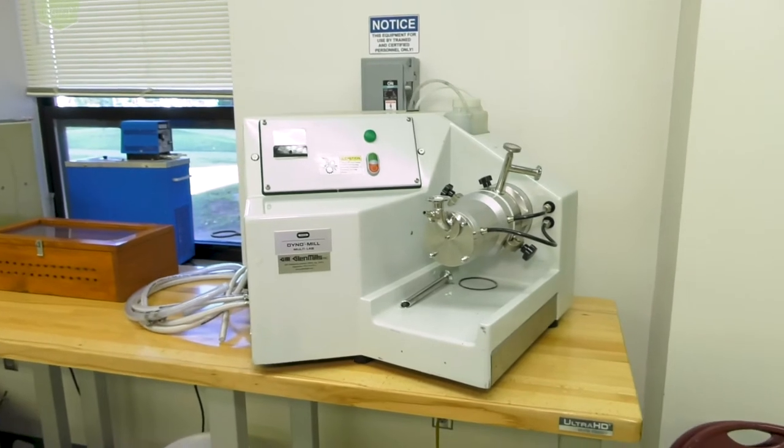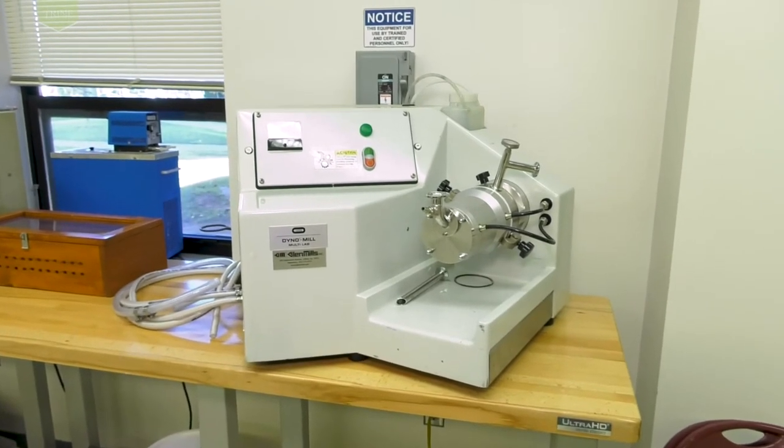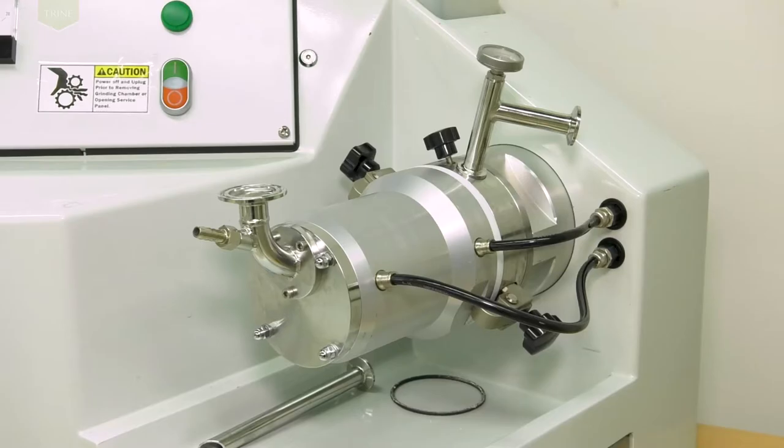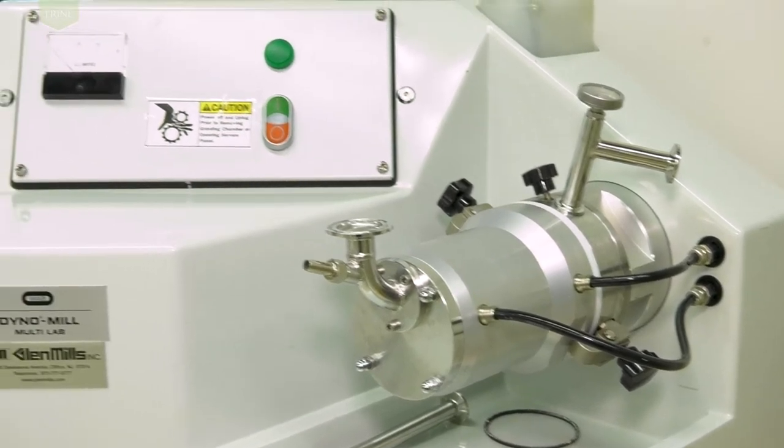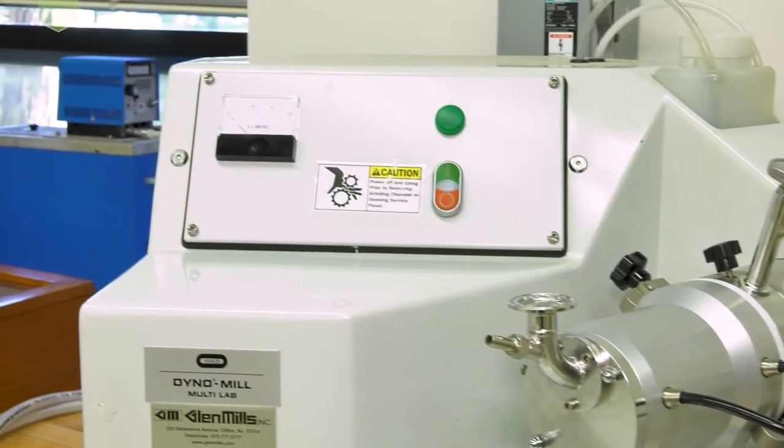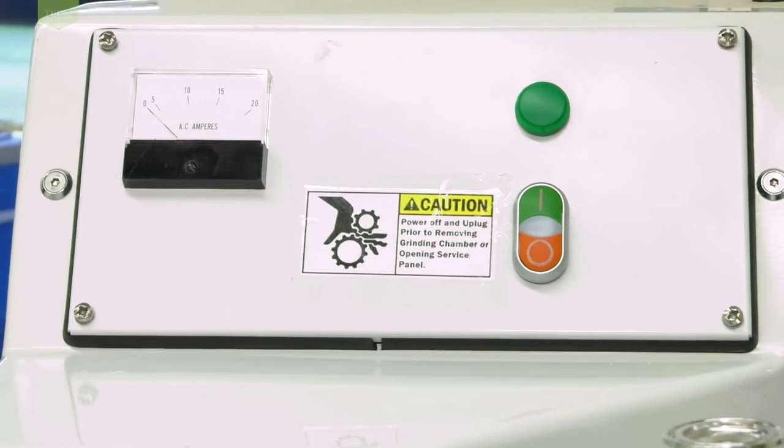The Glenn Mill Dyno Mill Multi Lab is a bead mill that allows for continuous production of emulsions. This equipment is used for senior projects involving consumer product development such as soaps, lotions, conditioners, or shampoos.